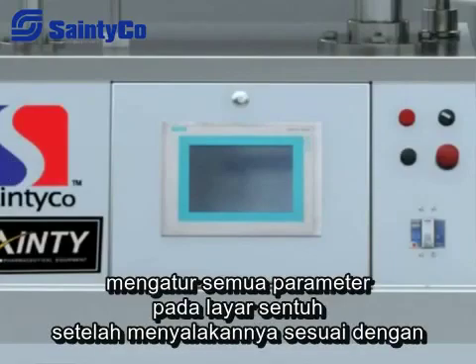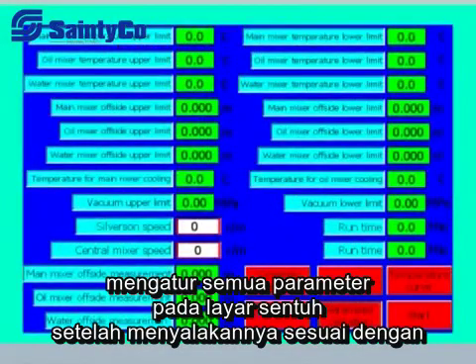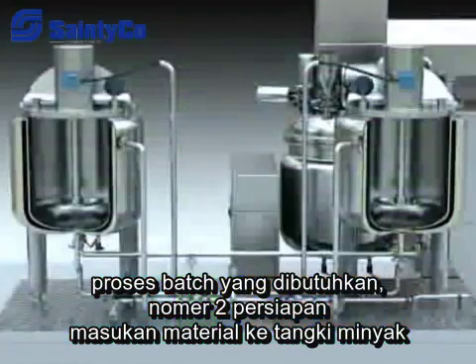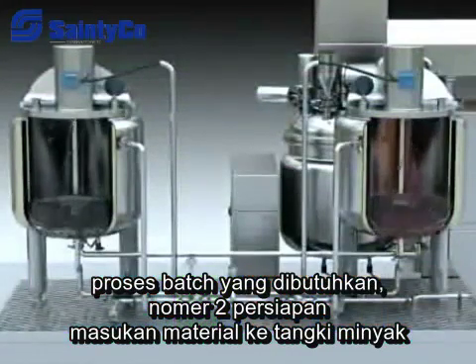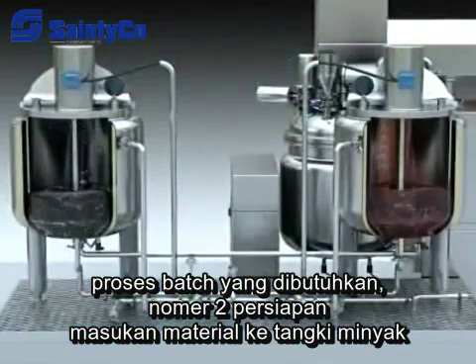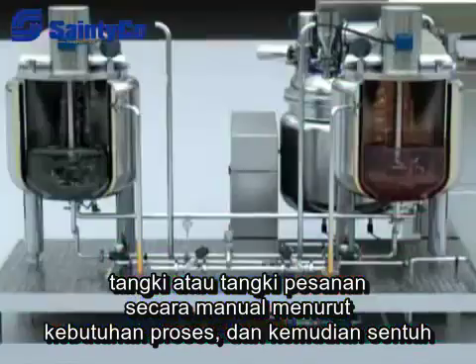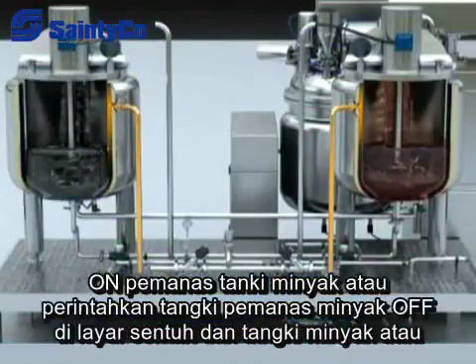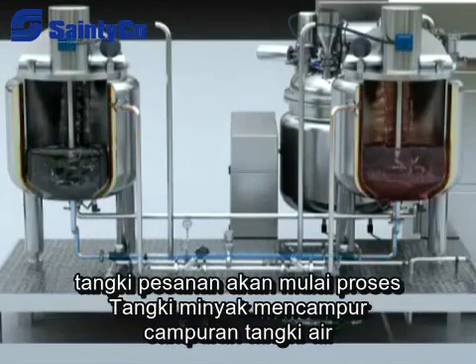Operation instructions: Set all parameters on the touch screen after turning it on according to the required batch process. For pre-treatment of material, load the material into the oil tank or water tank manually according to the required batch process, then touch the oil tank heat or water tank heat button on the touch screen and the tank will begin to heat.